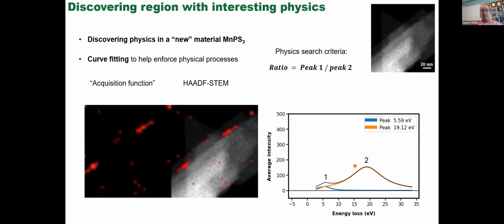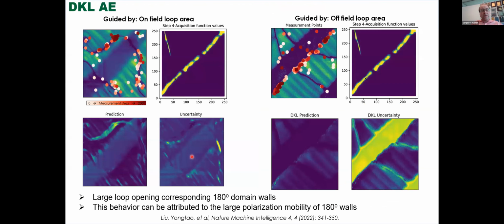This is unusual because in this case, we came up with a fairly general physical criterion and implemented it on the working microscope. So it's not a simulation, that's actually the data streaming from the microscope.